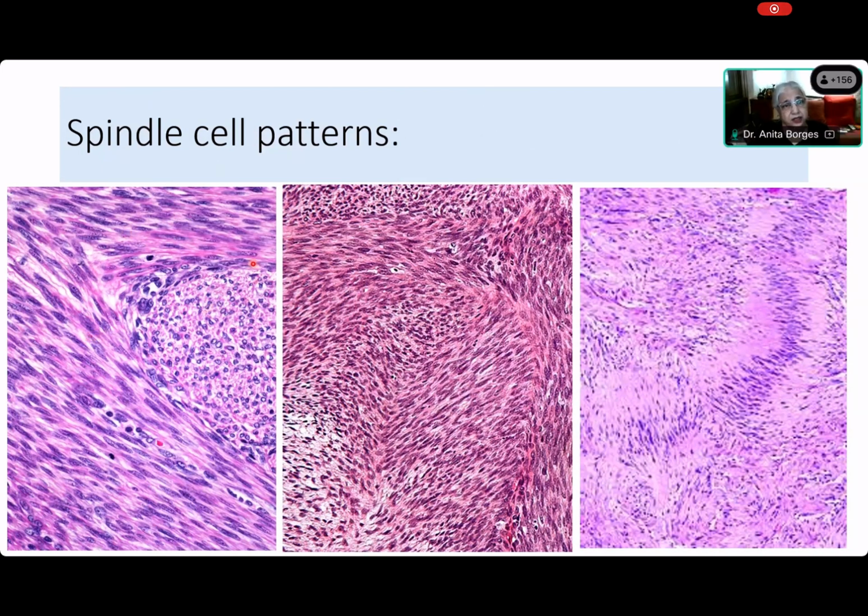Slender bundles. Here's a bundle. Yeah, you can see this. I had outlined that bundle, right, Saida? Yes or no? I told you this. We said that bundle was cut at right angles. At right angles, okay. So it's not a slender bundle. Is it a slender bundle? No. So slender has got nothing to do with the definition of a fascicle. So what is the definition of a fascicle?